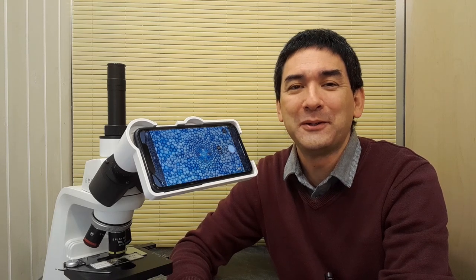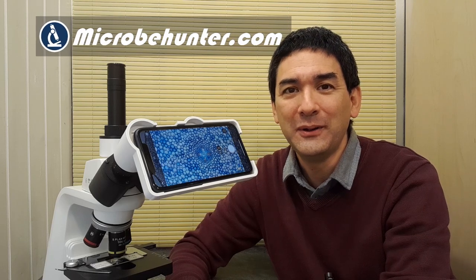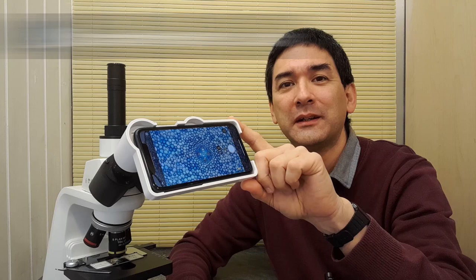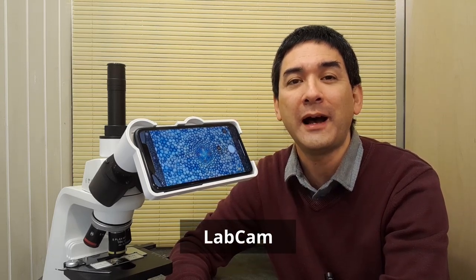Hi, hello and welcome. Microbe Hunter here and today I would like to do another product review. I would like to review this mobile phone adapter. It is called the LabCam Ultra and it is a mobile phone adapter for the iPhone.